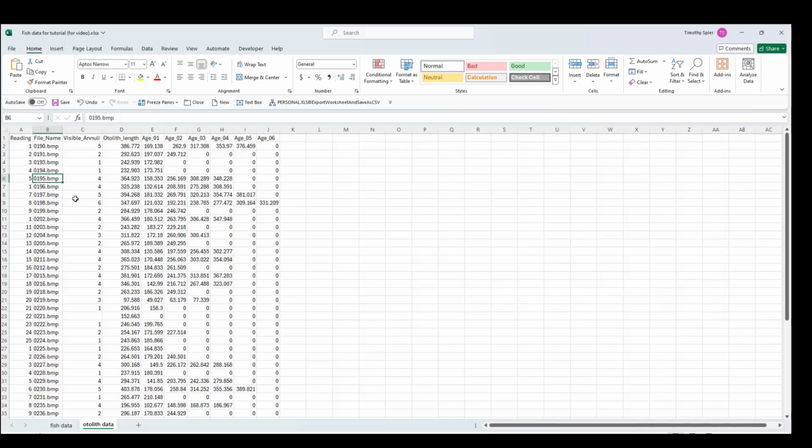And also, the data we're going to use to link this back to the original data has to be in the first column. It's not, it's in the second column. That's fine. When we go and select the data, we're going to start by selecting right here. We're going to just ignore this first column. But you got to have this sorted by this lookup value. Okay, so that's one sheet.